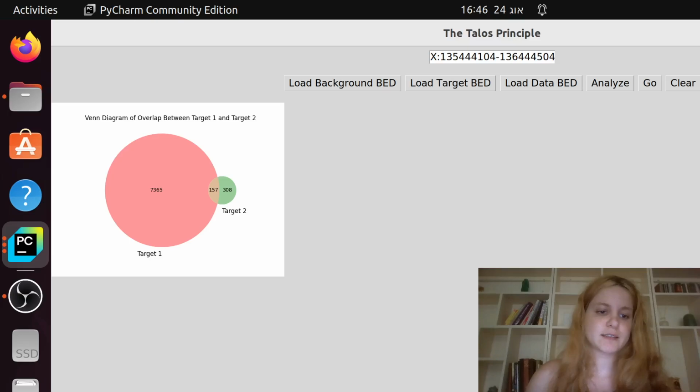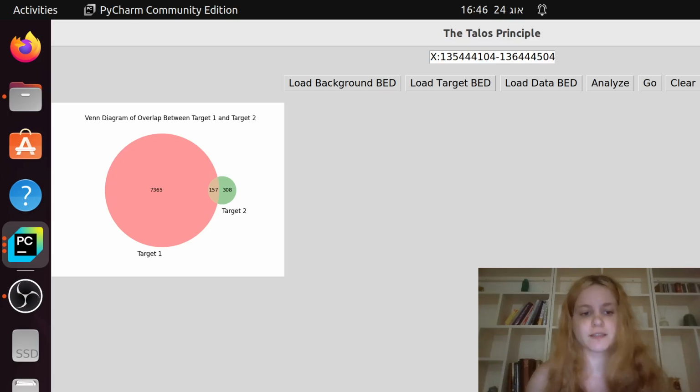And the two-sided is the harsher statistical test, and we also get significance in here. So it's very good, because if you know from the start that you want to check depletion, you can use this value. But if you don't know and you check both of them, then you have to use the two-sided.